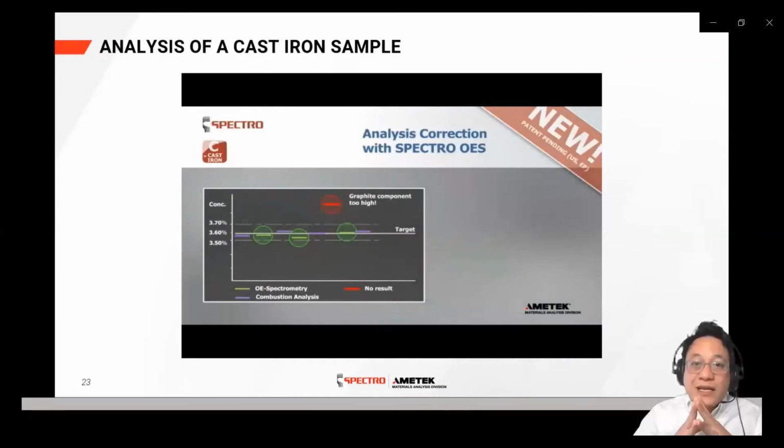This method is not invented to replace combustion, but to take the brunt of sample analysis work, allowing for fewer samples requiring combustion. Control measurements should still be done from time to time.